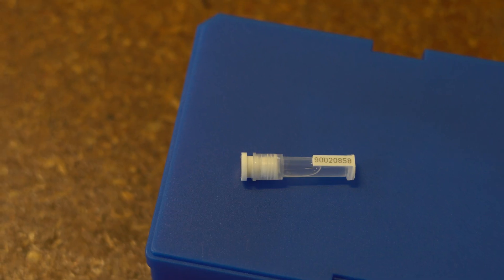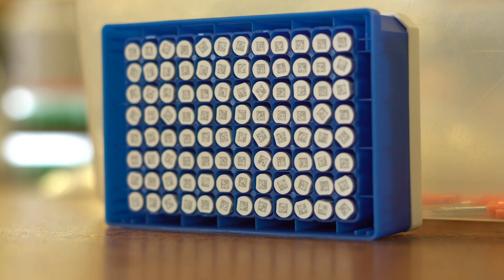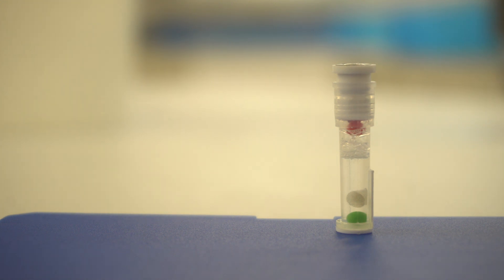Each vial has an 8 digit numerical code on the side and a matching 2D barcode on the bottom. A green ball indicates a sample has been taken properly. The vials are filled with a saline buffer which preserves the integrity of the sample and simplifies shipping protocols.